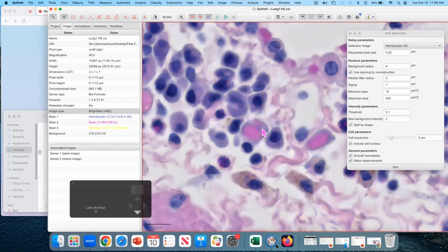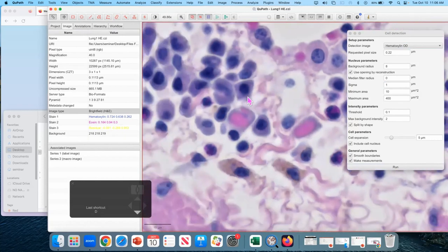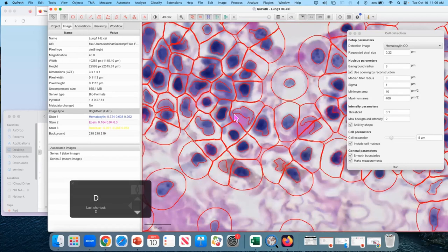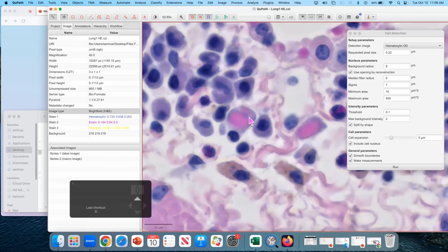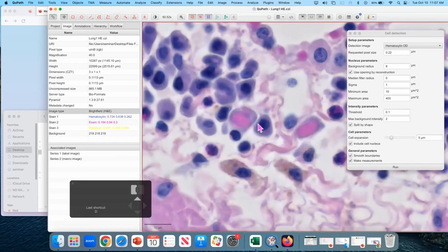Ken, what is this? Oh, so remember the cells that have the brown pigment? Mm-hmm. Those are what I said are likely hemosiderophages. Mm-hmm. So an earlier stage of that would be that the macrophages have to ingest the red cell. Mm-hmm. So I think that is a macrophage which has ingested a lot of red cells, which have started to break down, but the heme has not lost its color yet. Sometimes you get things like viral inclusion bodies and whatnot, but I kind of don't think so. Okay.